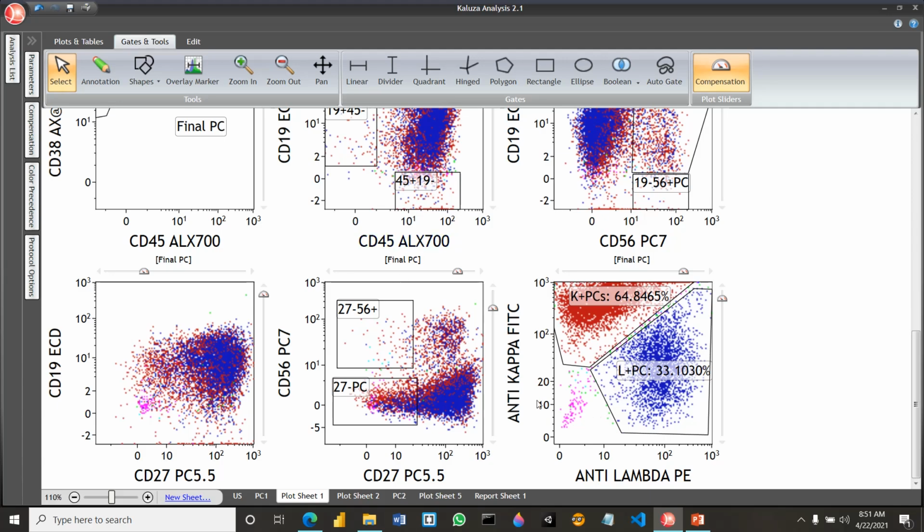In fact, in this light chain possibly we have put more amount of antibody. That's why it's pretty bright. So we have to tighten it down in such cases. If you have a smaller number of plasma cells and you put a higher amount of antibody, it can show very bright expression, so tightening down a little bit is helpful. Anyways, we can still see there are two different clusters of plasma cells, one is kappa and the other lambda, which looks pretty polyclonal.